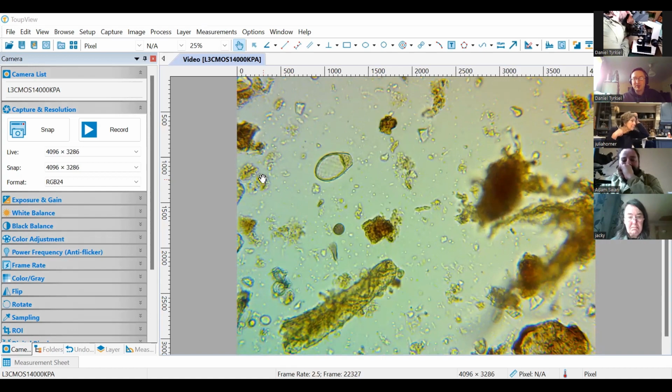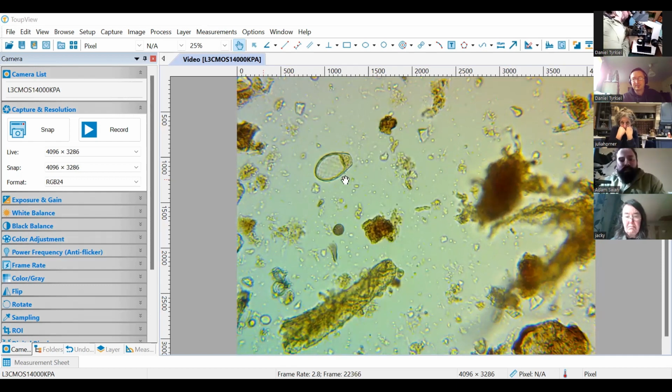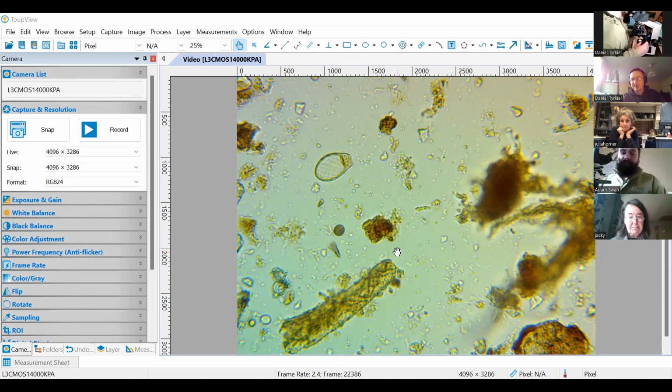But regular compost, which is kept aerobic, usually you'll see these guys, and you usually also see flagellates. And that's basically what you're after. So this guy, we just count 1. If there were 5 in the field of view, we count 5. I think that's already another example of a testate amoeba that looks a little bit different.